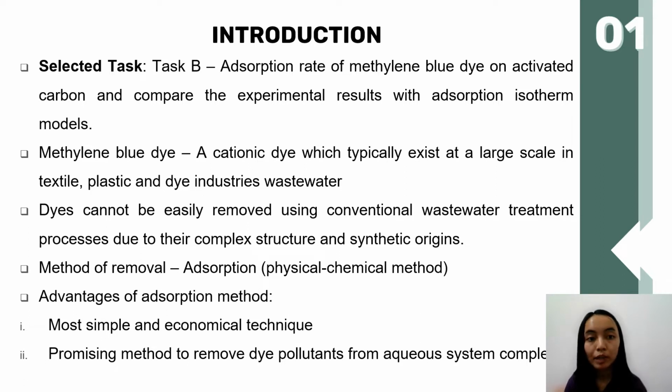The methylene blue dye is known as a cationic dye, which typically exists at a large scale in textile, plastic, and dye industry wastewater. Dyes cannot be easily removed using the conventional wastewater treatment processes due to the complex structure and synthetic origins. Due to this, the removal process of the contaminants will be done by using the adsorption method, which is known as one of the physical chemical methods.